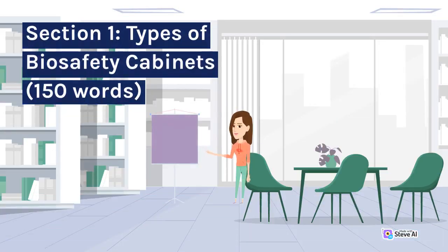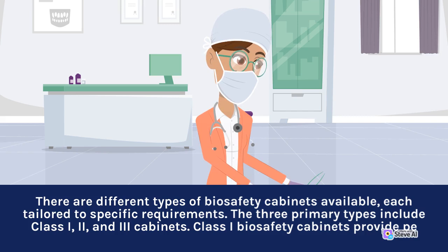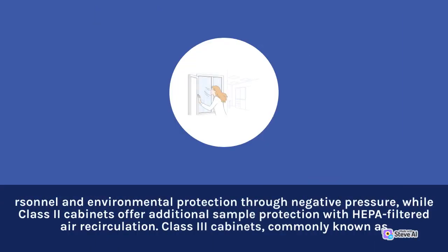Section 1: Types of Biosafety Cabinets. There are different types of biosafety cabinets available, each tailored to specific requirements. The three primary types include Class I, II, and III cabinets. Class I biosafety cabinets provide personnel and environmental protection through negative pressure, while Class II cabinets offer additional sample protection with HEPA-filtered air recirculation.